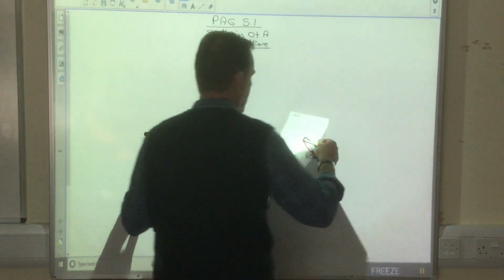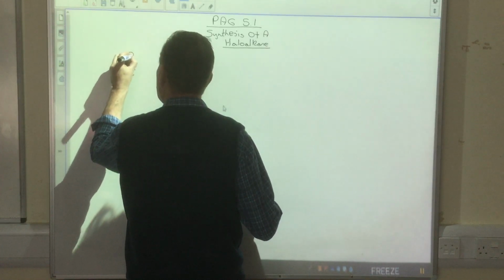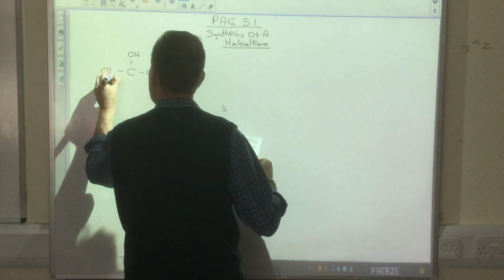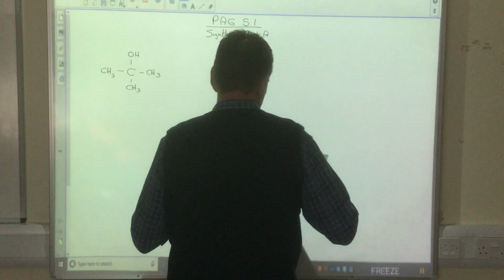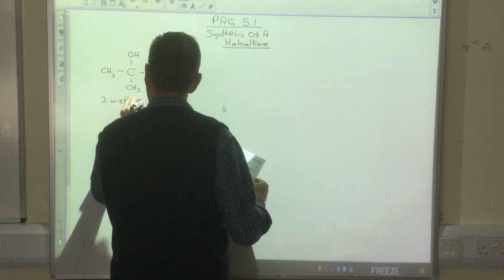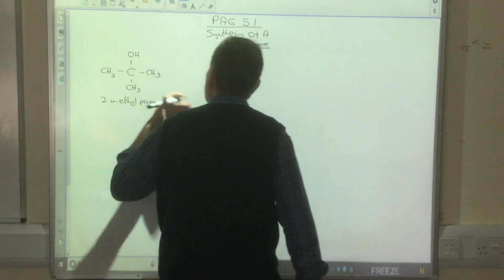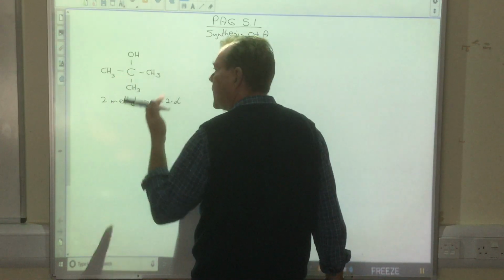Basically, this is the reaction we're going to be doing. We take an alcohol, 2-methylpropan-2-ol, a tertiary alcohol. Now I've told you that you can use a number of things to get your haloalkane.